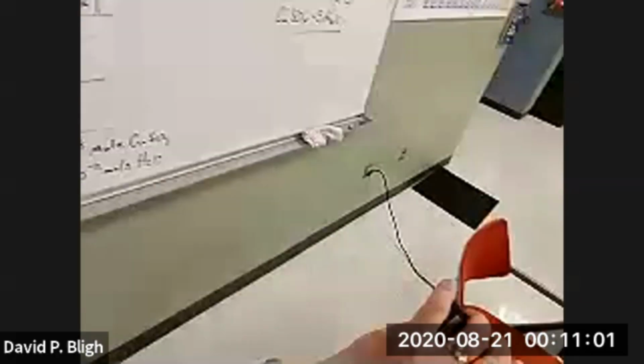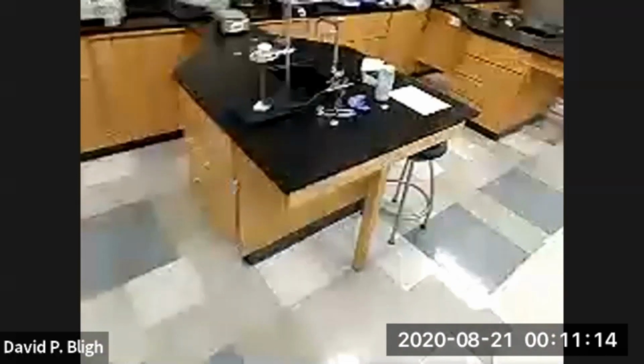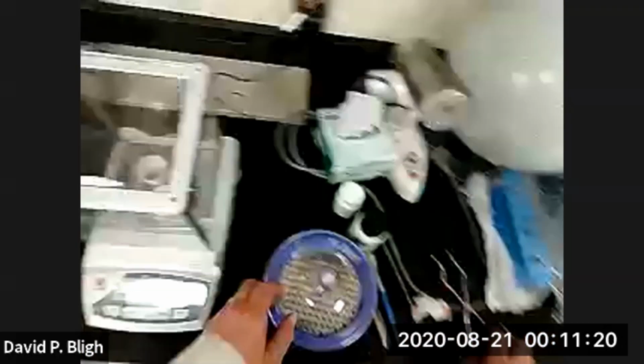Okay, I think it's time to check on sodium hydrogen carbonate and just see where we're at. All right. We're finished with this one.